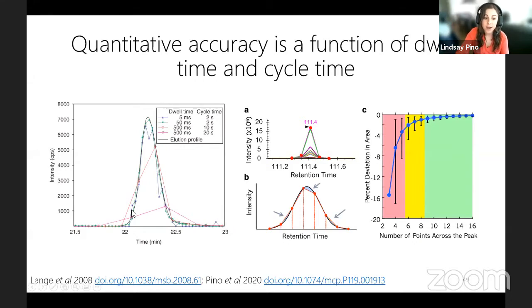The more measurements you have, for example this green line with all the points, the better it approximates the ground truth. The fewer measurements you have, in this pink line, the more difficult it becomes to measure and put together the underlying ground truth.